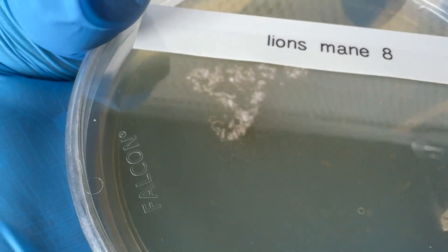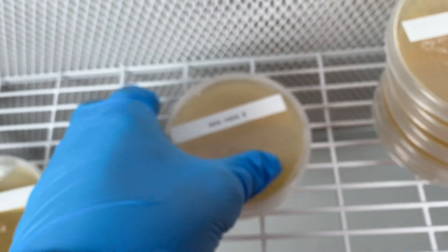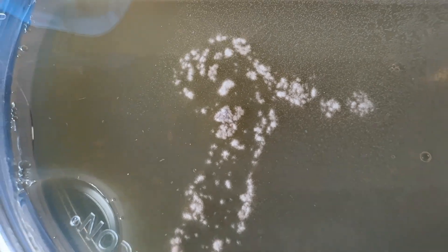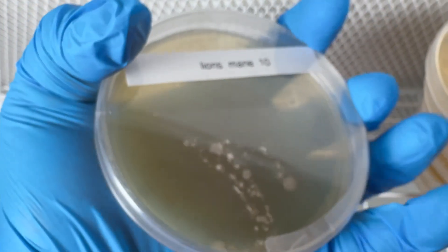Jar 8 was clean, jar 9 was clean, and jar 10 was contaminated.